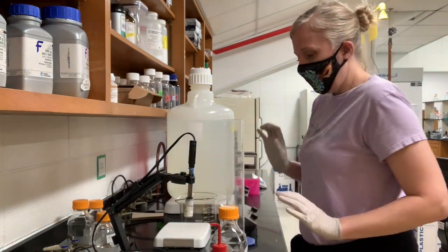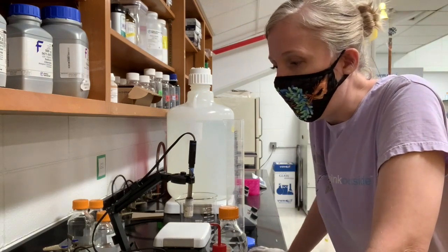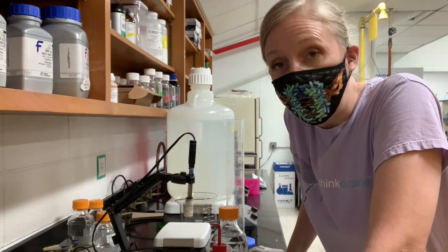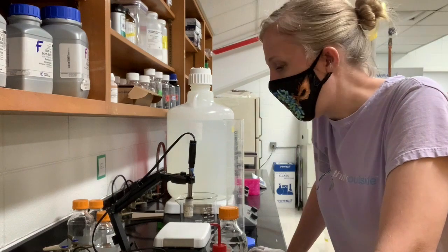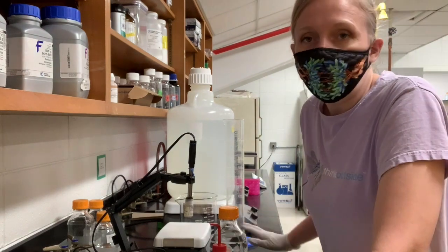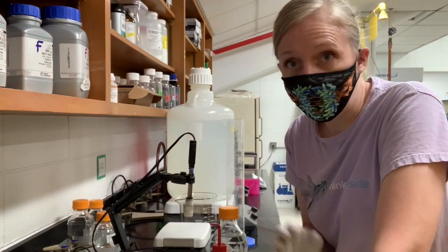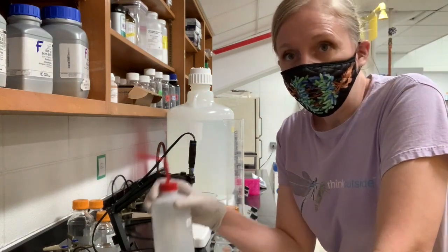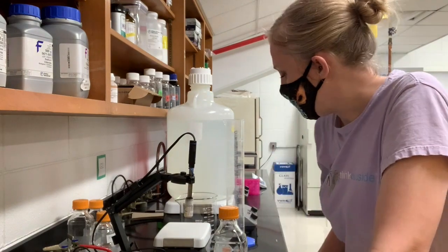So before you leave the space, make sure you've cleaned everything off. If you need to use some alga water or a chem wipe to wipe down the scale, that's fine. Sometimes you'll have powder from where you were weighing things out. You may have liquid from where you were pHing. You want to leave everything cleaner than you found it. You also may have chem wipes or tape or things like that that need to be thrown away. And if you need to refill the Elga bottle, you can use the ultra pure water. Elga is just another way we say that sometimes.